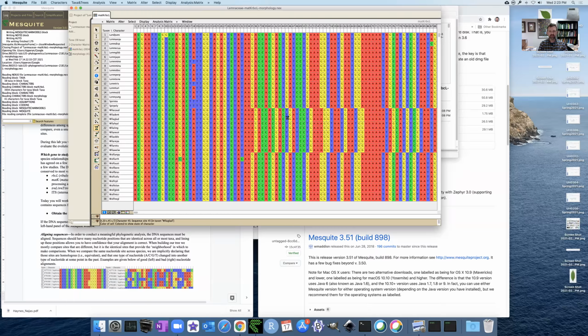And it's not just a nucleotide difference, there's a length difference here. And if you look carefully, you can see this tracks back to this set of A's here. So the A nucleotide: in the top block, there are 1, 2 A's and then a G. In the bottom block, there are 1, 2, 3 A's and then a G. And there are a few ways you could resolve this.